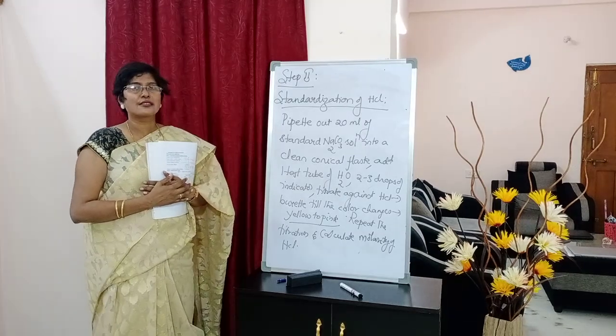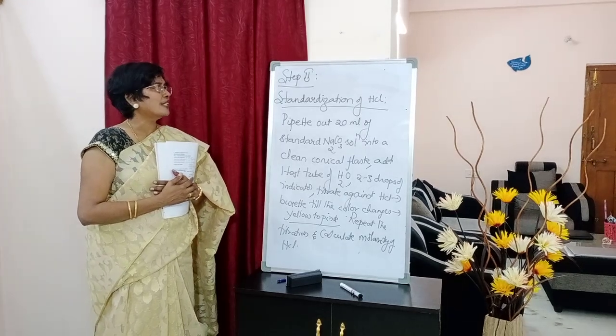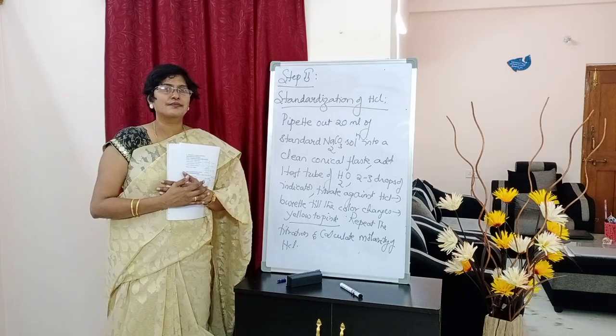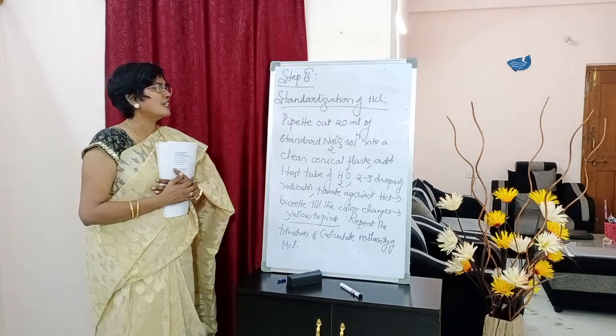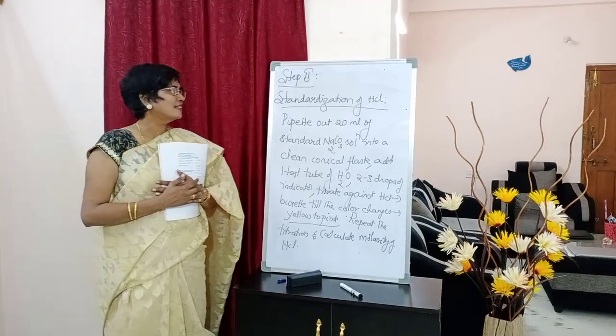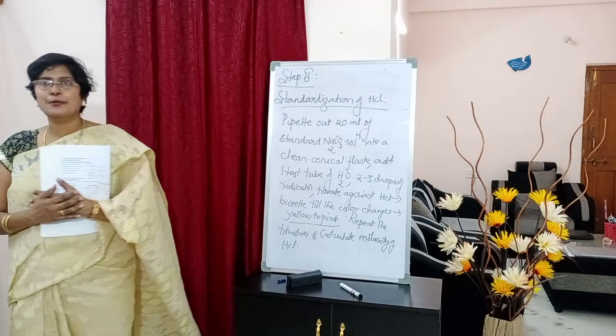Next, step 2, students: standardization of HCl. Underline the side heading. Please write down the procedure.